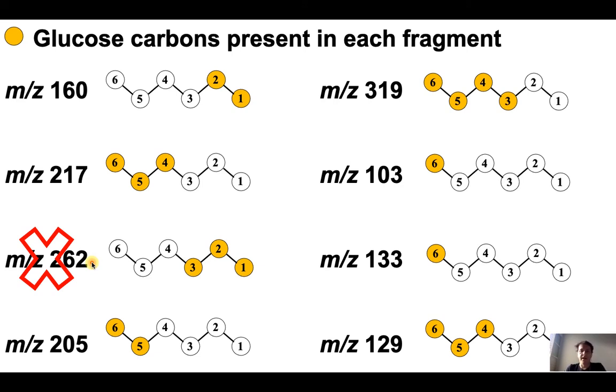regarding glucose labeling analysis. The 3 is also quite problematic because you have a second peak identified by GC APCI MS. And the 133, I don't know why, but the APCI data is clear, but we could not see an increase using the fully labeled glucose in the electron impact ionization.